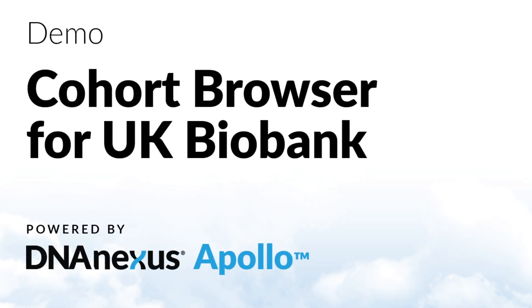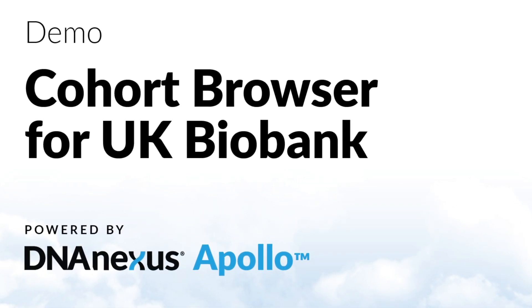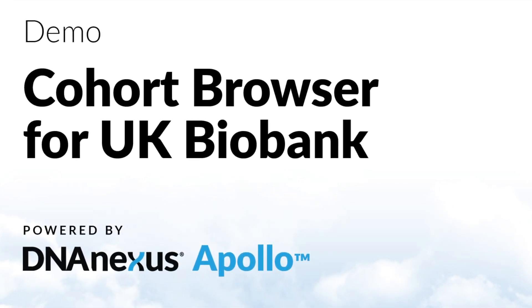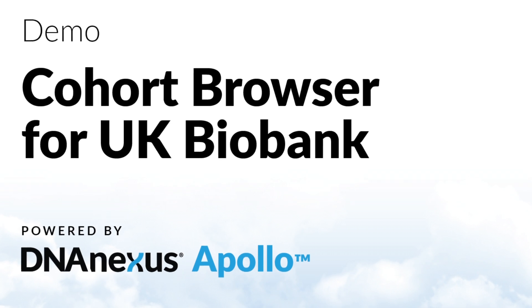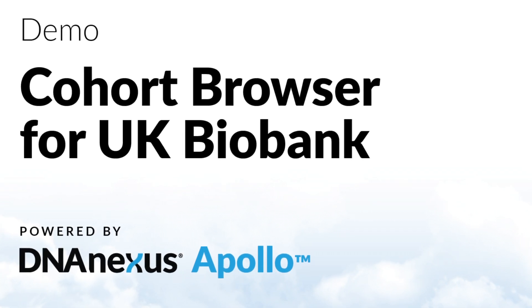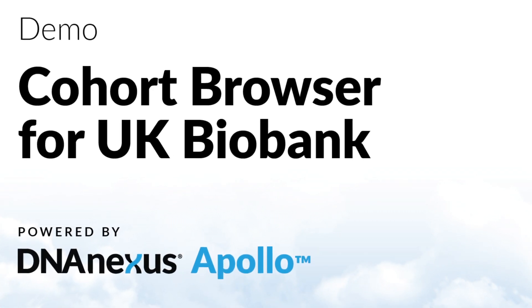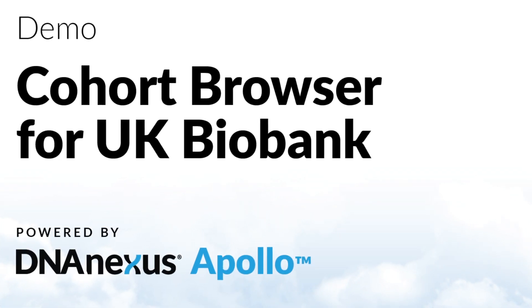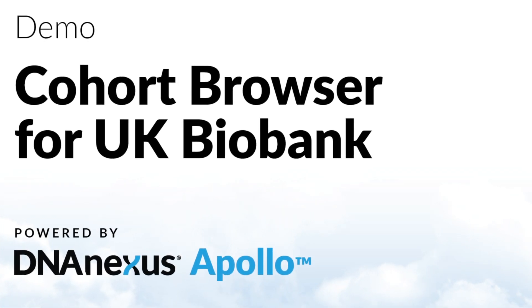The Cohort Browser has been used by scientists at the Regeneron Genetics Center as part of their effort to analyze and deliver the exome data of the UK Biobank study.